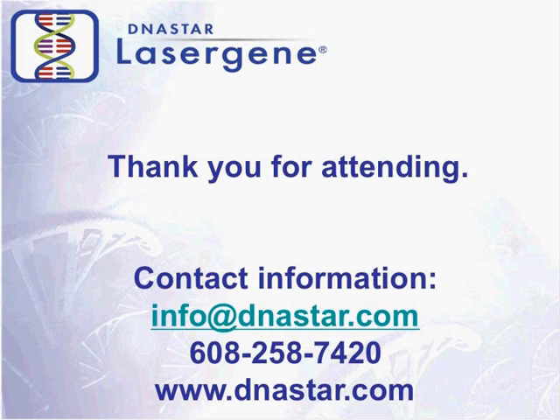Right now PacBio seems very expensive, and the reads are very long and error-prone. But there's reason to think that a hybrid approach using something very long and something very short could be very useful. It's hard to build up a genome assembly from things that are just small, and including other kinds of information like mate pairs is useful. Having very long reads would also be useful. So I think sequencing technology in the next 5 years is going to change a lot. We're going to see a bunch of new products out there. So this whole conversation about what we're doing with assembly today is really about today. It could change completely in a couple of years.